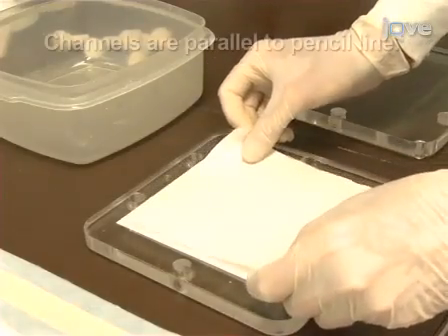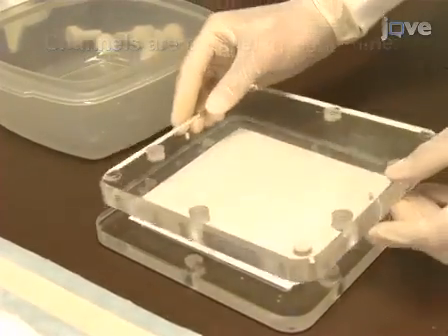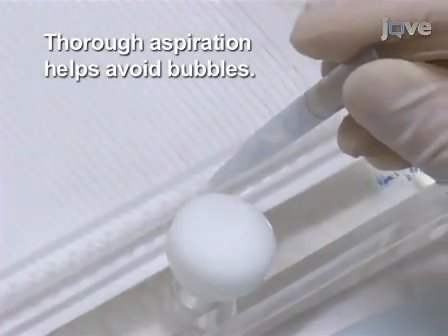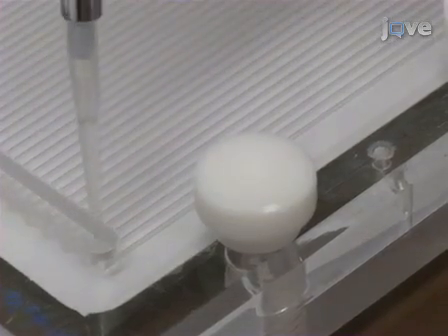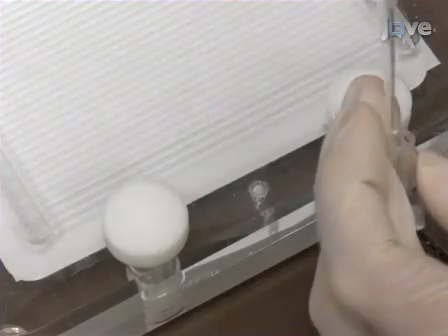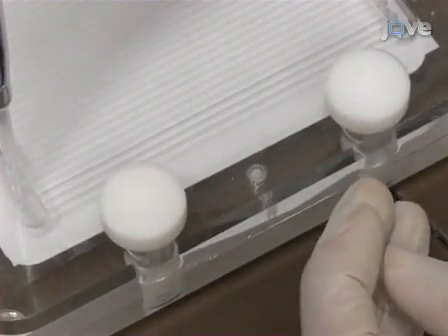Place the membrane in the mini blotter with channels running across the membrane. Then put the support cushion in place and close the blotter. Thoroughly aspirate any fluid from the channels. Fill lanes 1 and 45 with 150 microlitres of 0.5 molar sodium bicarbonate. Use 150 microlitres of each probe solution to fill lanes 2 to 44 in sequence, being careful to avoid air bubbles.